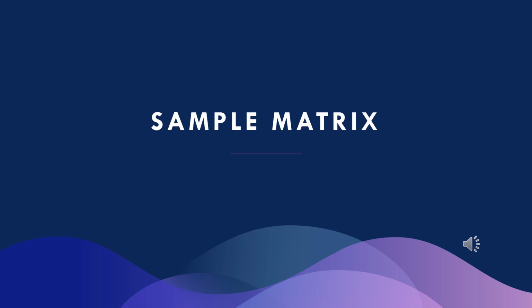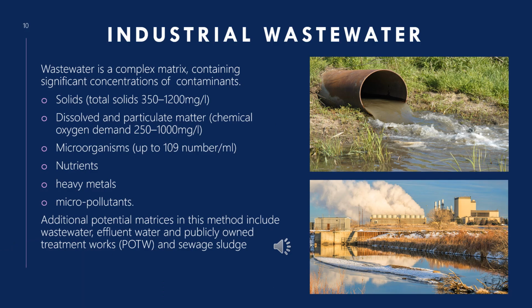For this method, the matrix is industrial wastewater. Industrial wastewater is a complex matrix. It consists of multiple contaminants like solids, microorganisms, and heavy metals, to name a few. Although industrial wastewater is the main matrix for this method, additional potential matrices can be considered, such as sewage sludge or effluent water.